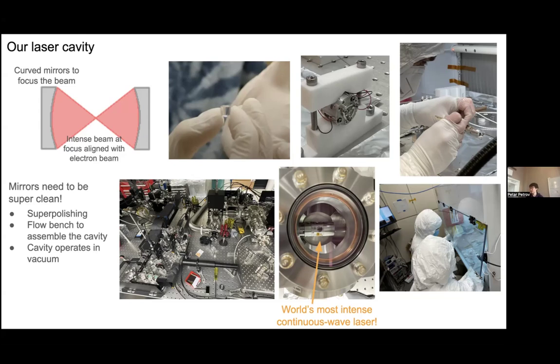Yeah, one thing is that the laser spreads out a little bit, so you can see in the drawing that it's defocused by the time it actually hits the mirror. And also, these mirror substrates themselves don't actually see the hundreds of kilowatts of power, because all the light is being reflected at the front surface. So we're only sending in maybe 10 watts, but we're getting 80 kilowatts at the center because of this amplification.